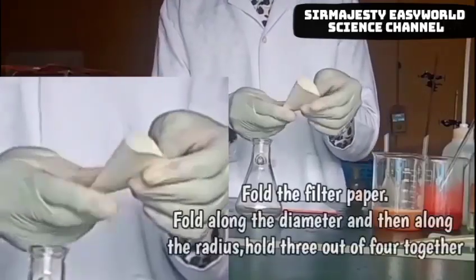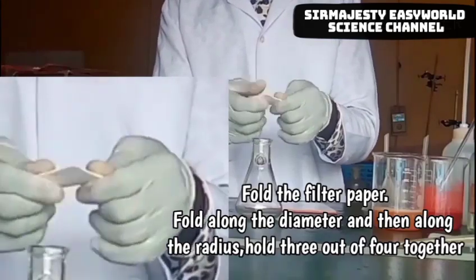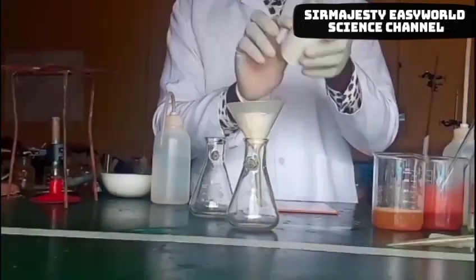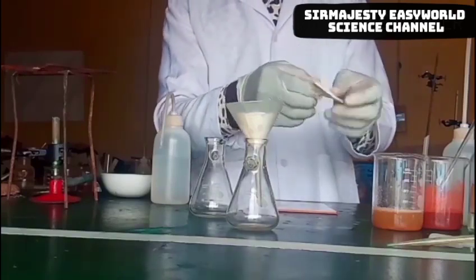You fold the filter paper — first fold by diameter, then fold at the radius, and you have formed the shape of a funnel. Then you insert it into the filter funnel. You do this for both mixtures. You fold again because you have two mixtures here; the separation technique is based on the same idea for both.